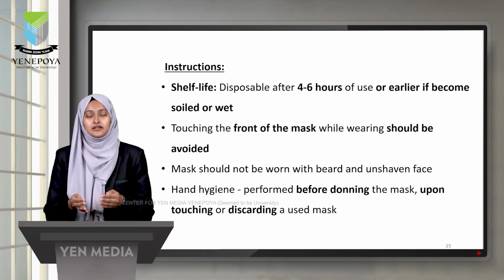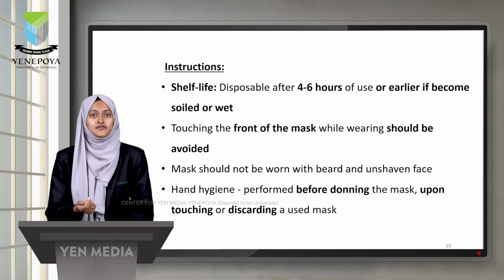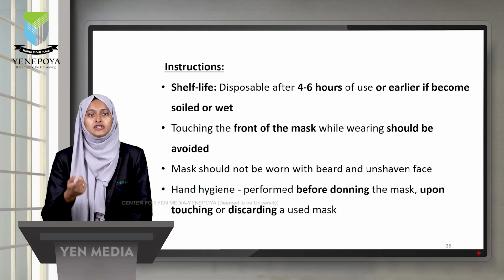If it becomes soiled before 4 to 6 hours, maybe even after 1 hour of usage, it has to be removed then and there. You should not wait for it to complete 4 hours and then only discard. If it becomes soiled, maybe after 1 hour, it has to be disposed of, or even if it is not soiled, it has to be disposed of within 4 to 6 hours of use.